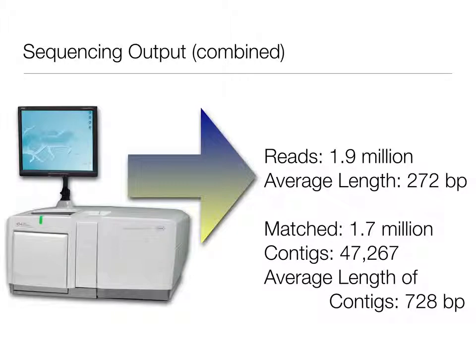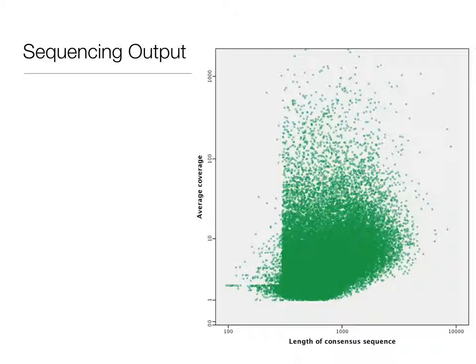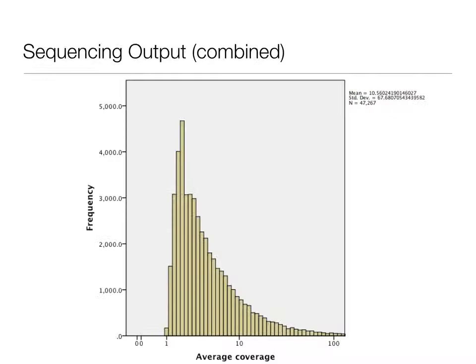Again, this is kind of outdated, but it's fun to look at old stuff. It gives you an idea of what our output was years ago in terms of coverage and consensus length from the 454. Another way to visualize the coverage, that's the depth, which is important. This is something that we could definitely do in class this week with open source software, to create heat maps. This one is between what? Liver and testes, yeah. We happened to do two tissues. That's all that.